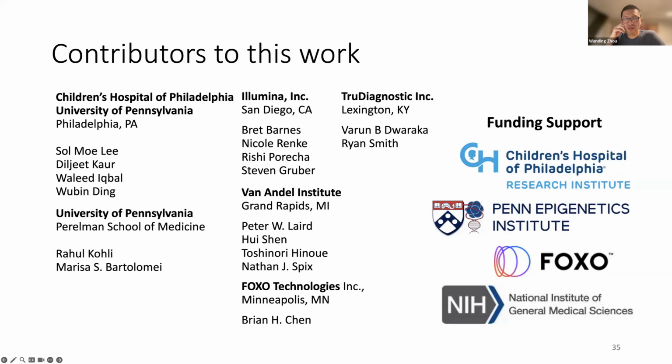But there are also some challenges that come with those calibrations, because the application scenario with DNA methylation arrays is so diverse. If you do such calibration on cell lines, it might not work on primary tissues, primary cells. If it works on one tissue like blood, it might not work on other tissues like buccal cells or brain tissues. So that might be the reason why a full calibration might be challenging. But I think that's an important point. I agree.